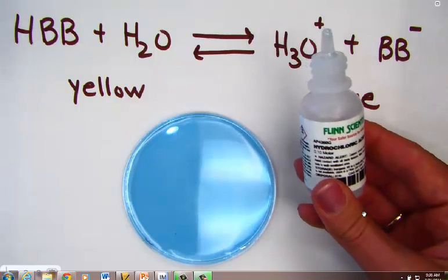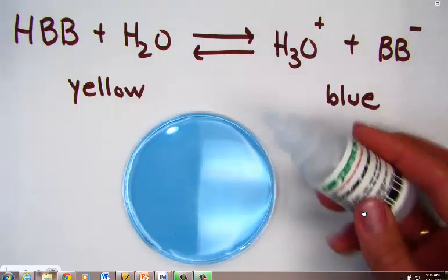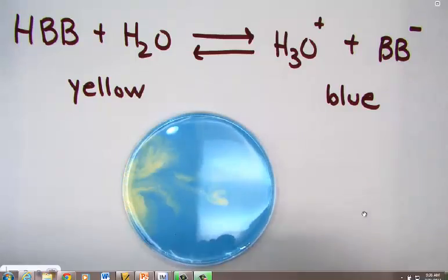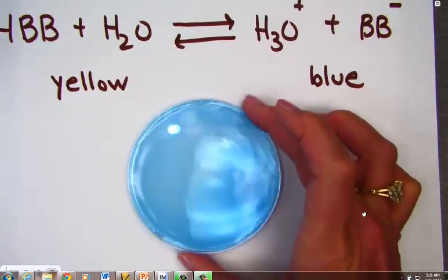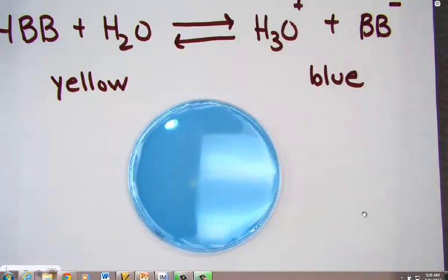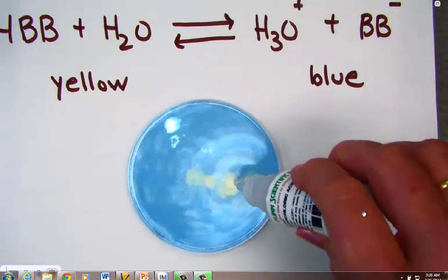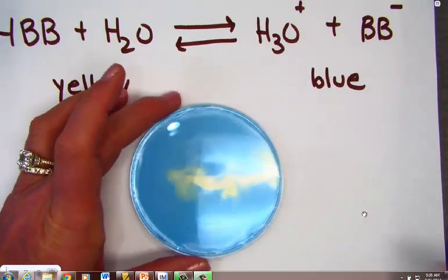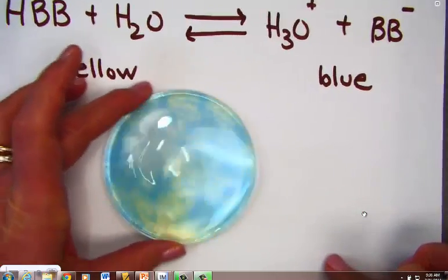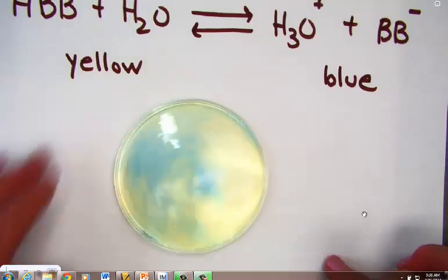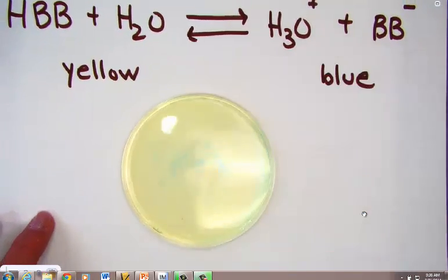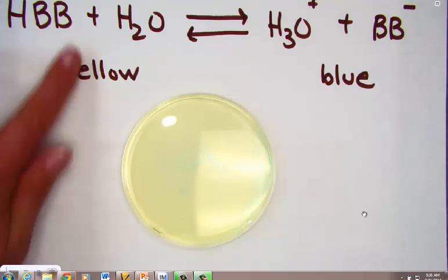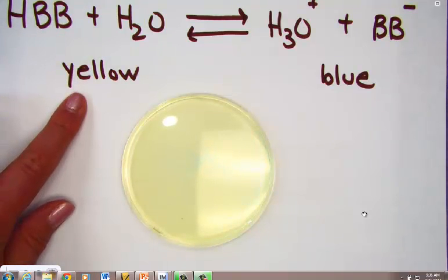Let's add hydrochloric acid, HCl. Upon addition here, we'll see a color change. For the volume of base I've added, I need to add a little more acid to get it to change color and stay. I can now see that the yellow has appeared. I must be on this side of my equilibrium.